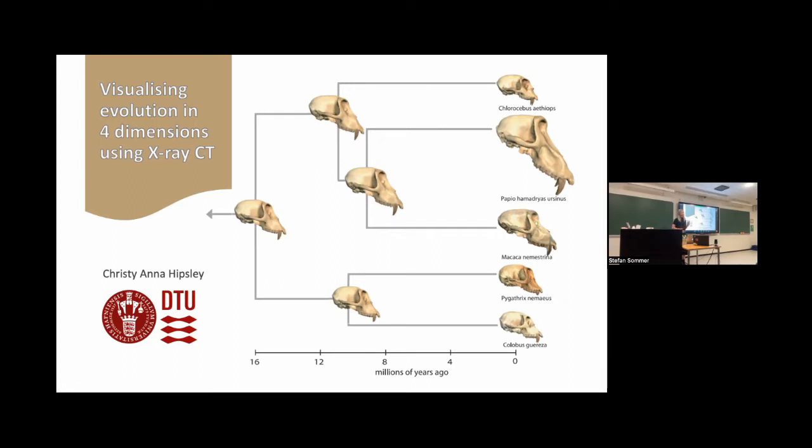So thanks for that. I'm defaulting to a talk I've given in various forms in the past year or so. So if you've seen it, log out, take a nap, or whatever you want to do. It's basically looking at the many ways that digitization benefits evolutionary research, with a focus on museum collections, because that's my background.